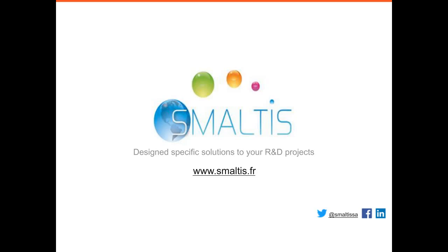Next one is for you too, Dr. Oberdanner. Do you offer plates with different coatings? No, all of our cell plates are plasma treated, so we do not offer any special surface coatings for various in vitro systems. Just standard cell culture treated plates.